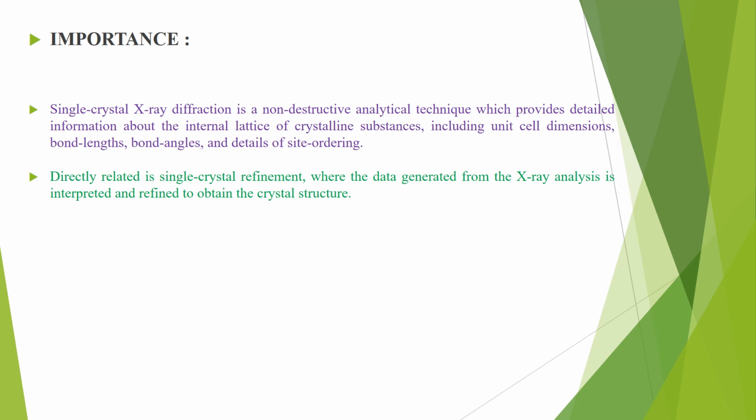It is directly related to single crystal refinement, where the data generated from the X-ray analysis is interpreted and refined to obtain the crystal structure. That means the data generated from the X-ray analysis is directly used for single crystal refinement, and also it is used to obtain detailed information about the crystal structure.